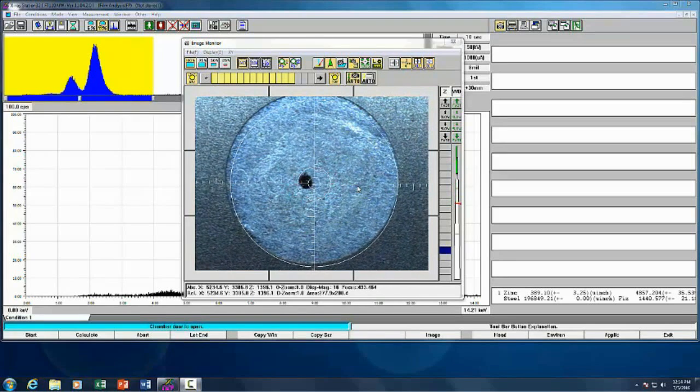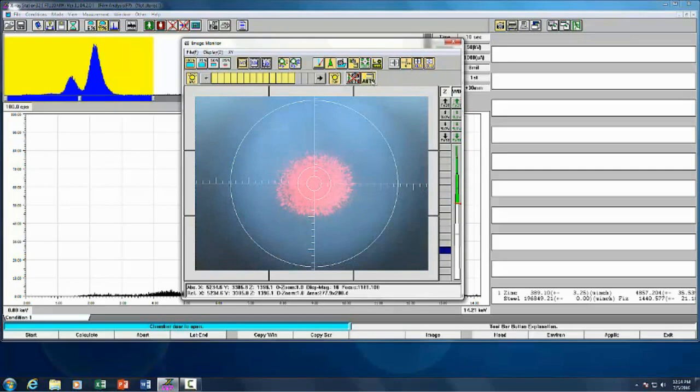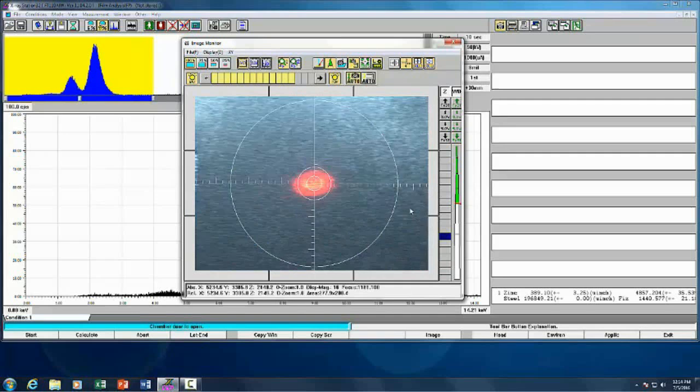The camera moves into focus, but our head did not move, just the camera. I want to move the X-ray tube head so it's at the same height as the last measurement, so I will hit Auto Approach. The head moves and automatically focuses. I'll now move back to the lower one and show you reverse.